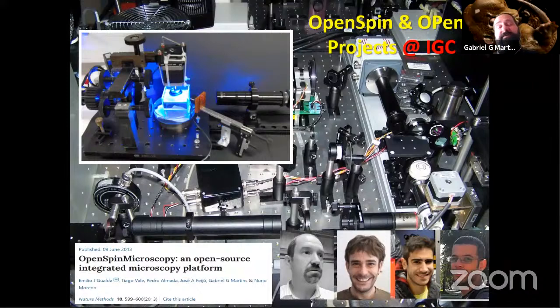It's said, again, this might be anecdotal, that Zeiss actually had the original patent and had forgotten about it for 7 years. So it was taking a while for Zeiss to come up with a commercial system. This is a completely new system, everything had to be redesigned. So 5-6 years down the road, several groups worldwide decided, this is actually not complex to manufacture. Let's start building one. And building your own home-cooked version of a light sheet microscope was one of the major driving forces of open source in biology and in microscopy in the last decade.